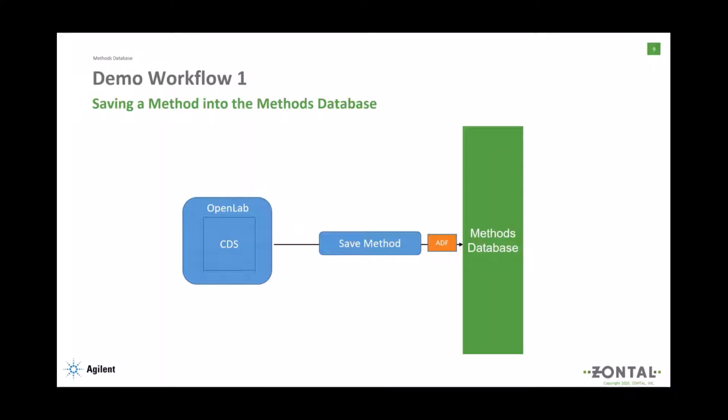So what I will show you in a demo right after the slides is that I export an existing method to ADF and upload that ADF into the methods database. Then the ADF is being ingested into the Zontal space area. Then you will see as soon as it's in the archived area section, I can download the ADF. Please, the next slide.